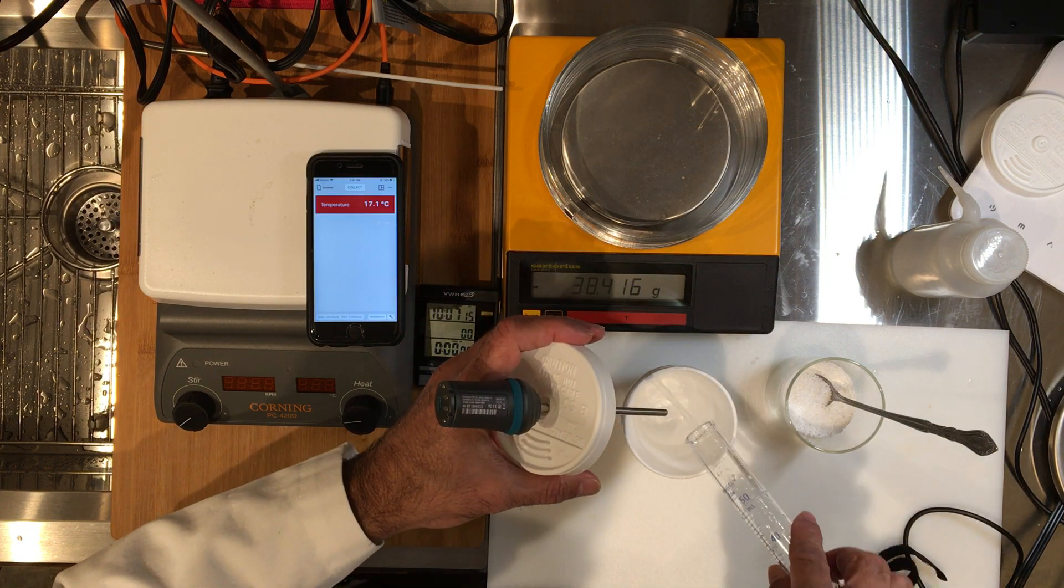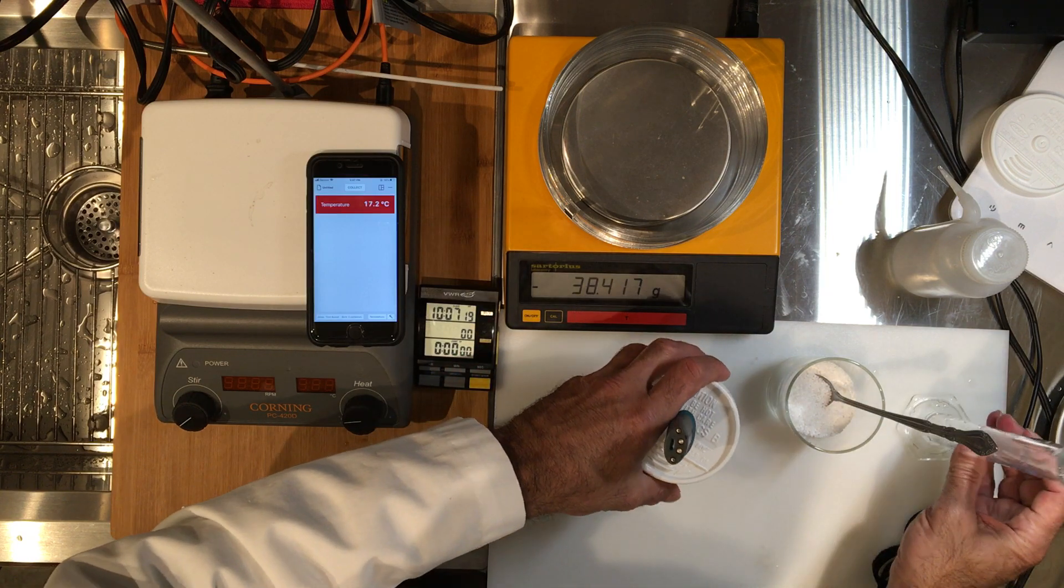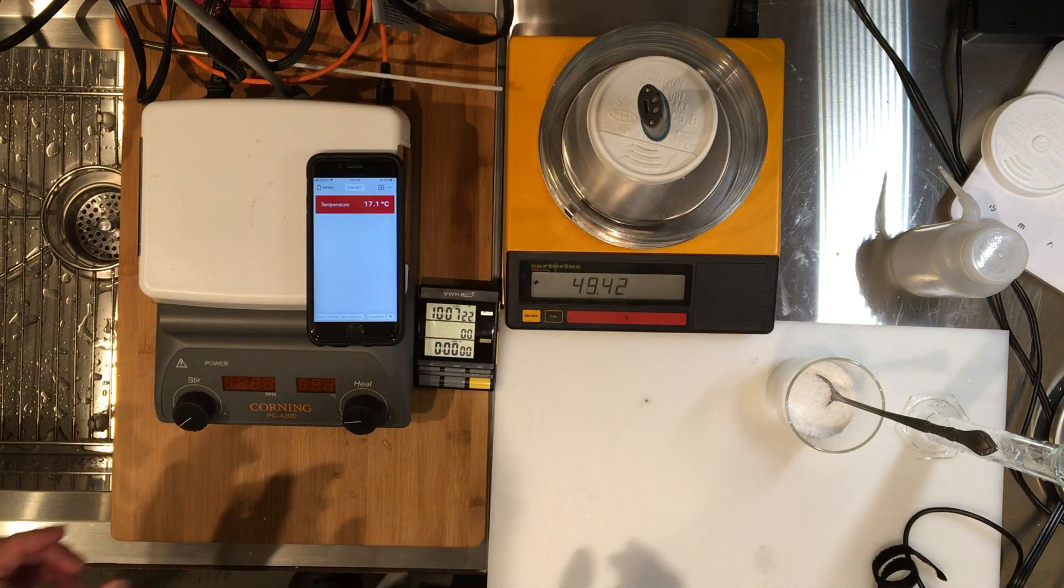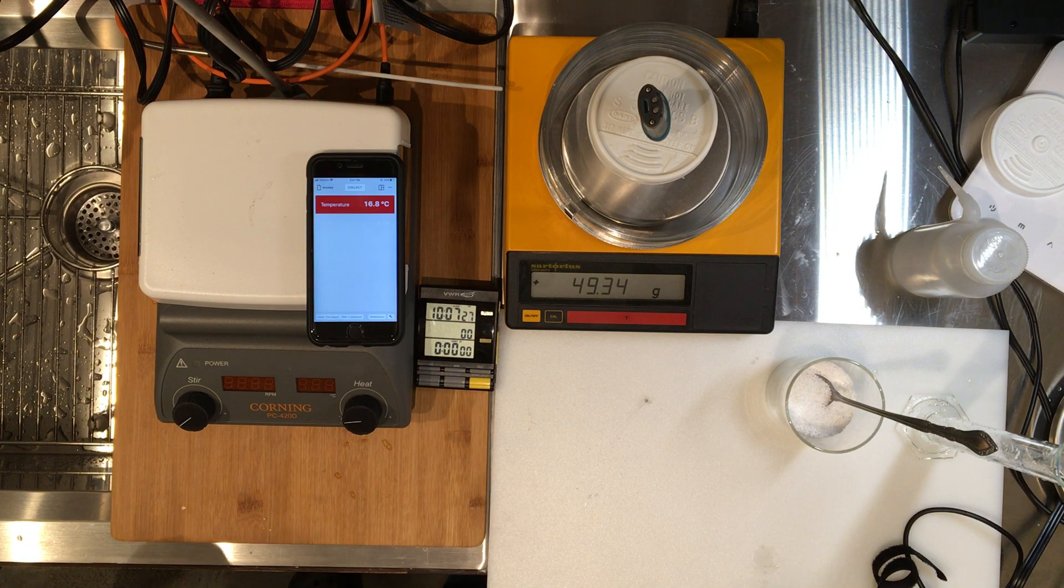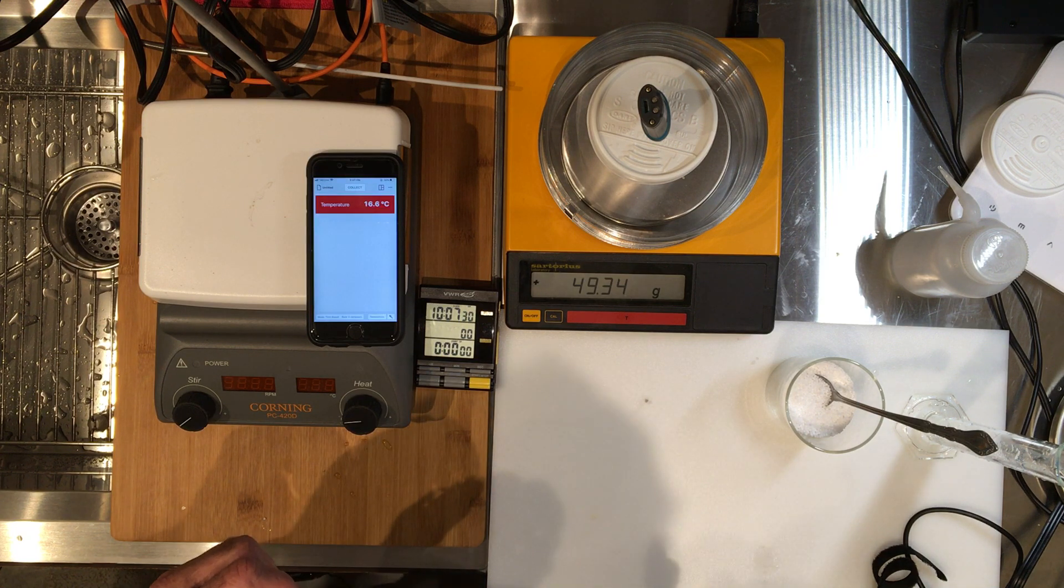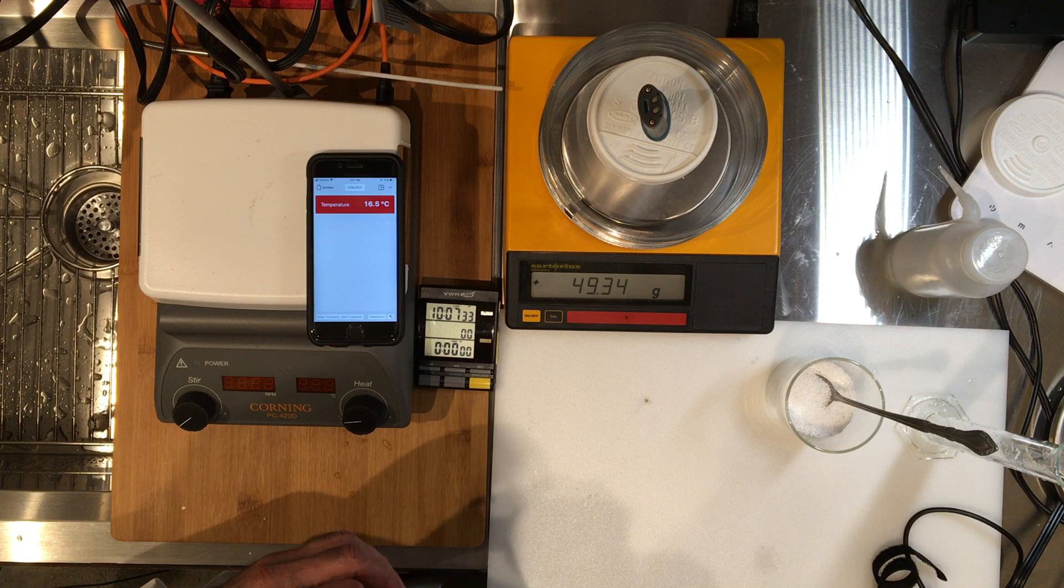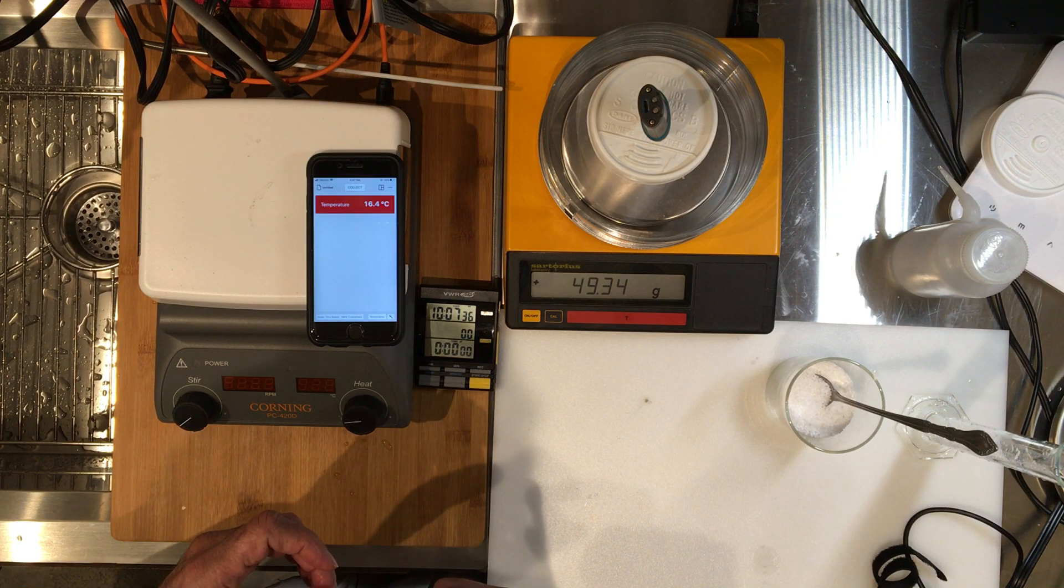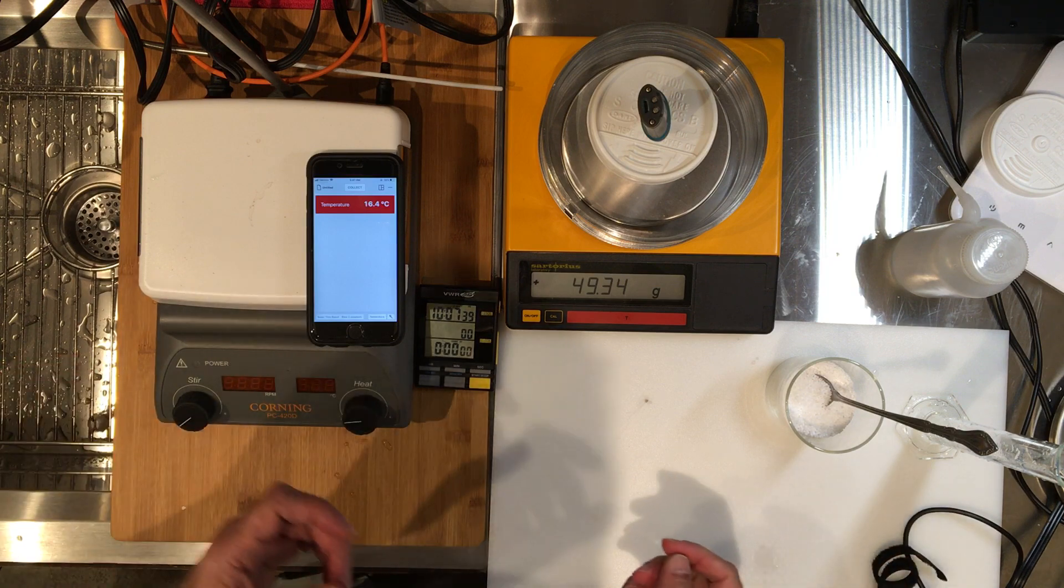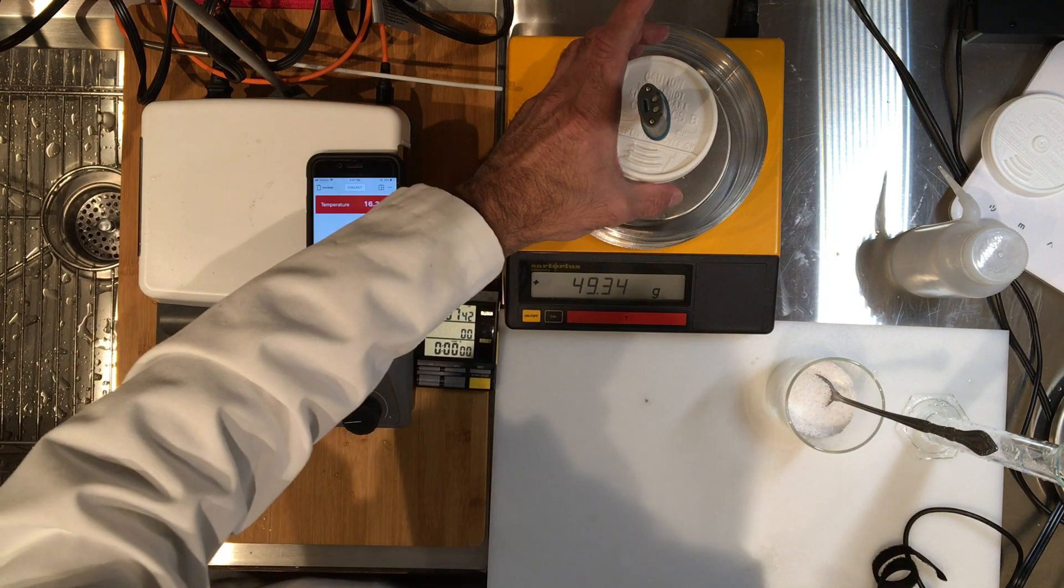So please record this mass. This is the mass of the water. It's 49.34 grams. You can see that the density is roughly less than one, because 49.34 grams in 50 milliliters roughly is a density of less than one. But anyway, the mass is the important part here.